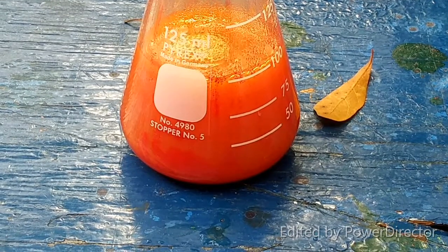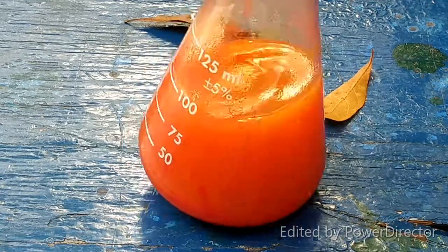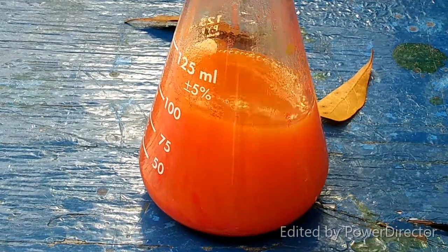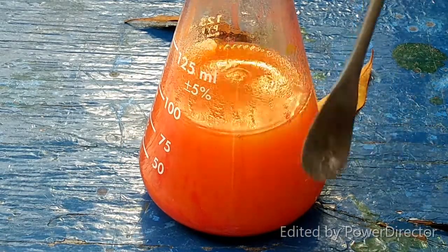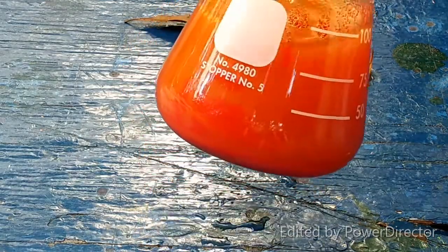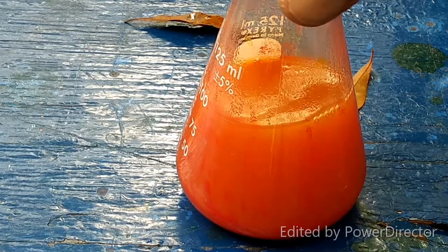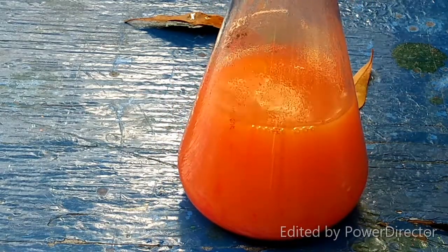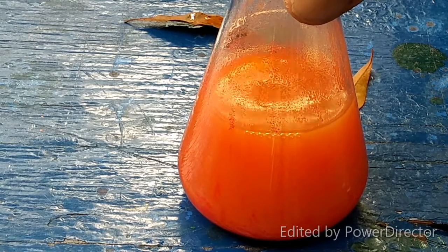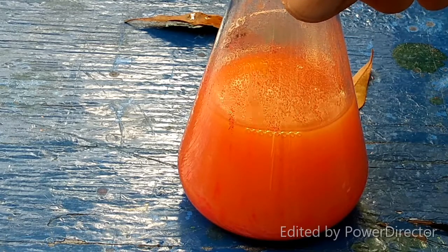One thing I wanted to point out is that it's actually very easy to just take anything and stick it down in there and scrape the crystals off the side of the flask in order to get everything down in the bottom. You'll probably have to do this a couple times as it cools. I guess you could wait to do it all at once. I just don't like letting things build up through layers too thick, because then it could start to harden up.